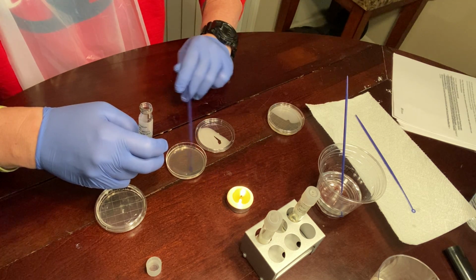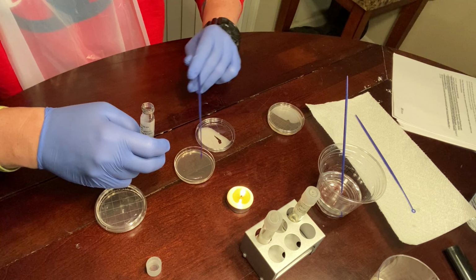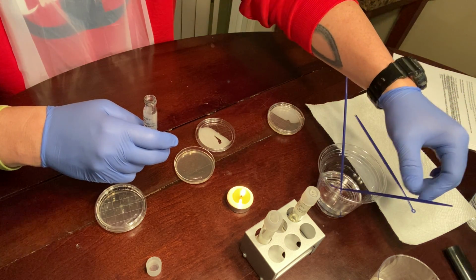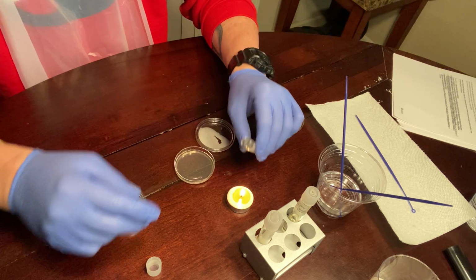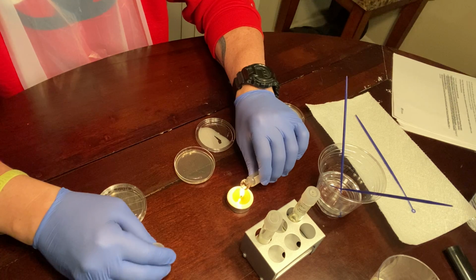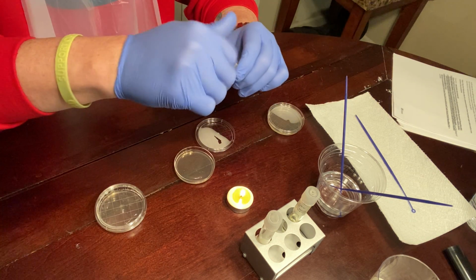And I'm going to zigzag here. Put that in the alcohol. Sterilize the rim again. Replace the cap.